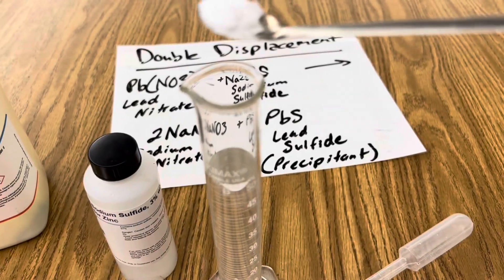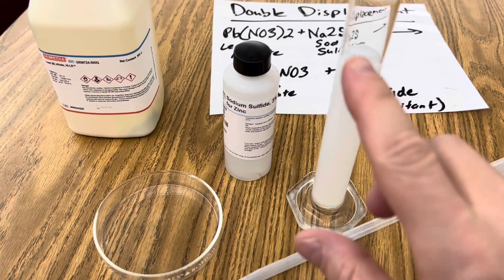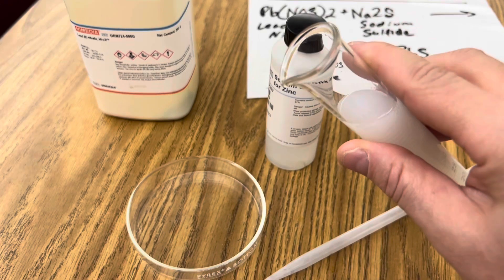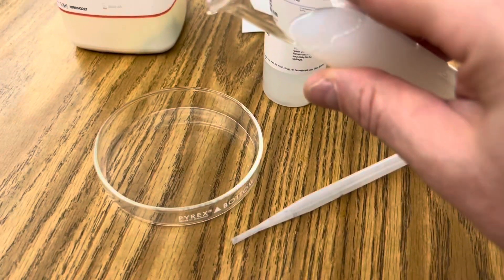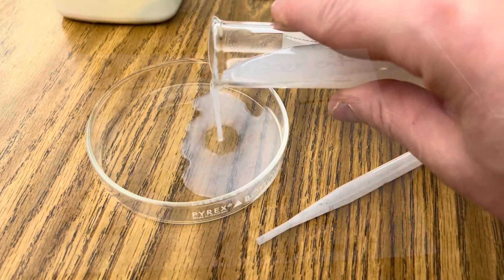I begin by adding about 5 grams of lead nitrate to my distilled water. Now that my lead nitrate solution is ready and is completely dissolved, I'm going to add a little bit to this petri dish so I can compare the reaction in the graduated cylinder and in the petri dish.